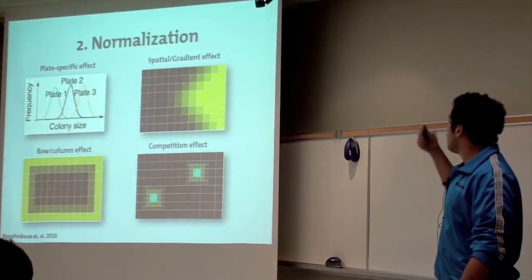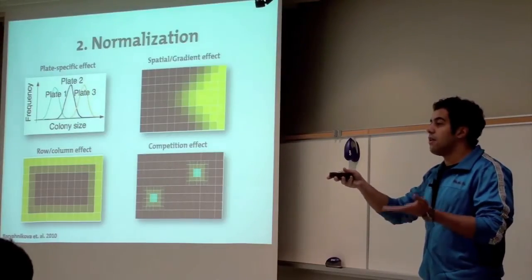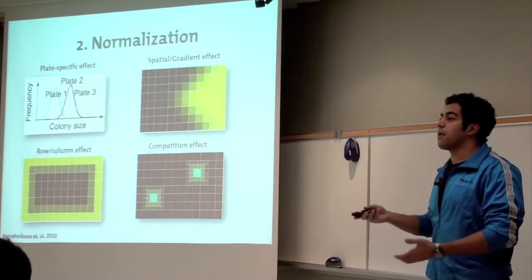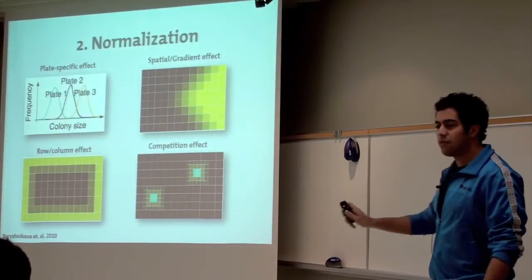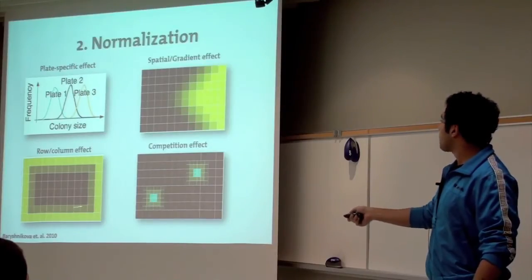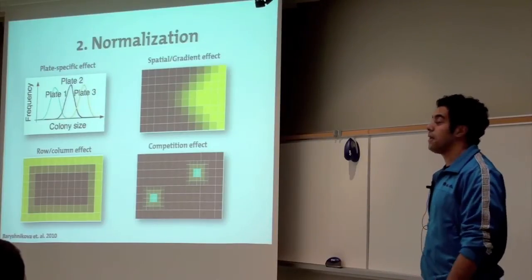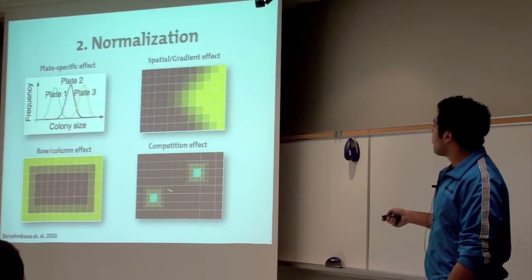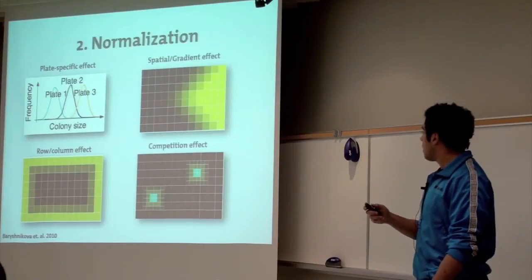You get nutrition based effects like spatial or gradient effects where you might have a screen on a tilt or something, so you get a gradient in nutrients and so some colonies are growing bigger than others. You have this row column effect where the colonies on the border are growing more because they have more access to nutrients, so there's not that much competition. And then you also have this competition effect where if you have small colonies here, you have larger colonies around it because, again, they have more access to nutrition as compared to the ones in the middle.